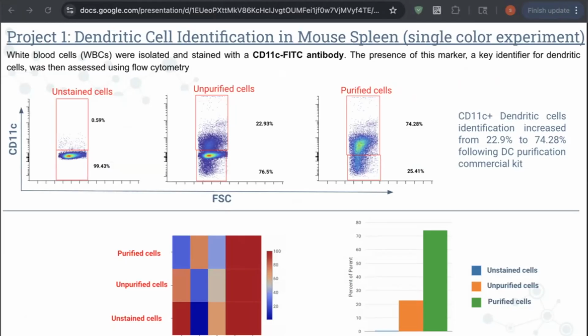Our first step was data quality control. This was a crucial part of the process. We carefully checked for any artifacts or inconsistencies in the raw data, ensuring its reliability, as you can see in the figure below. They show changes in the cell.